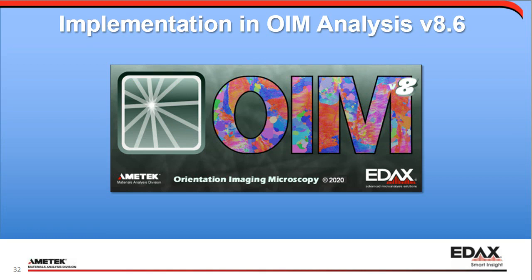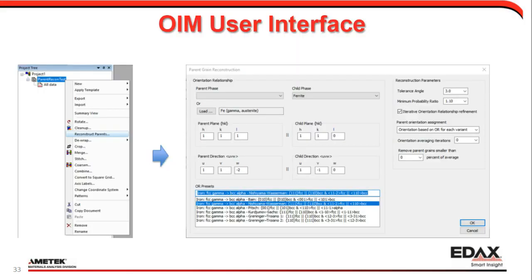So just as an example, we've implemented this into, like I said, OIM Analysis 8.6, which I hope is out by the end of the day, frankly. We're just finishing that. That's good news. So the user interface is pretty straightforward.